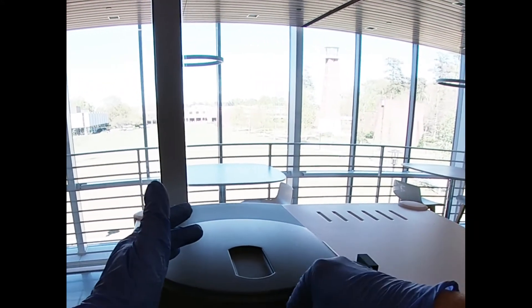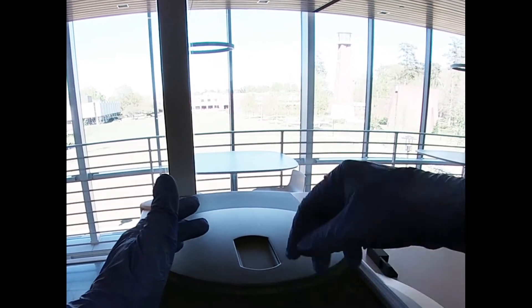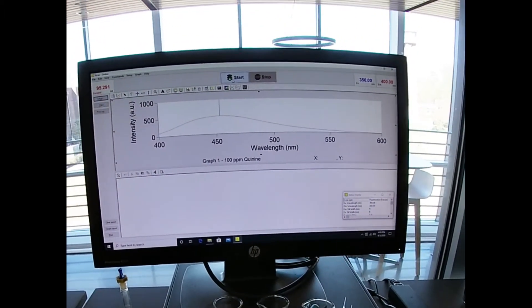We're going to take our quartz cuvette. This is also transparent on four sides, unlike the UV vis cuvettes, because we have to measure at a 90-degree angle. So we've got a cuvette placed, and we're going to start our scan.